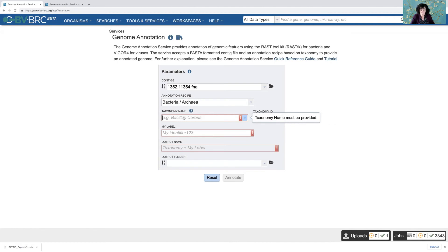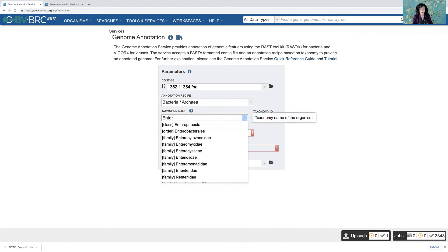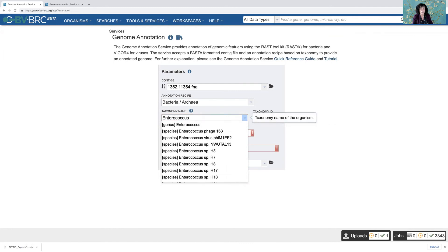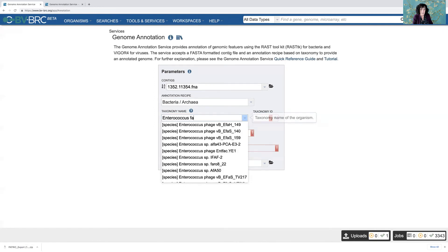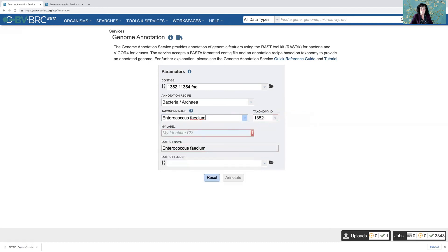But with bacteria, we want to get as far in as we can. You have to be able to spell and see it's trying as I'm typing these things in, it's trying to find text that matches. And here it tells me, look, these match. And this is the one I want. So I click on Enterococcus faecium and it also enters the taxonomy ID.